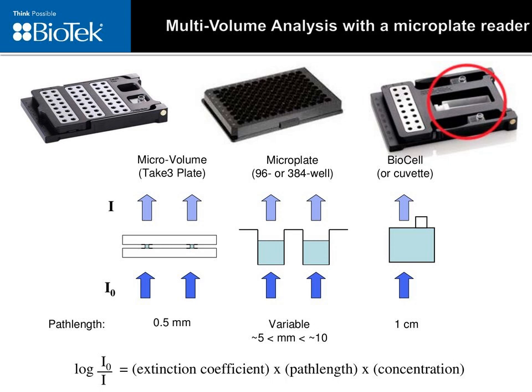Another question, how could I test a sample that consists of single-stranded DNA versus double-stranded DNA? Looks like this person had used some other dyes that bound to both.